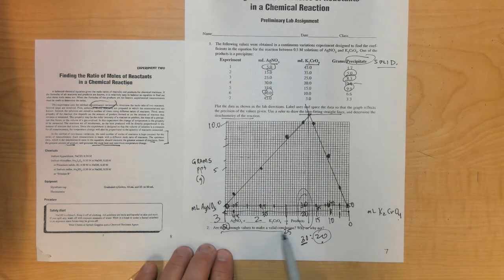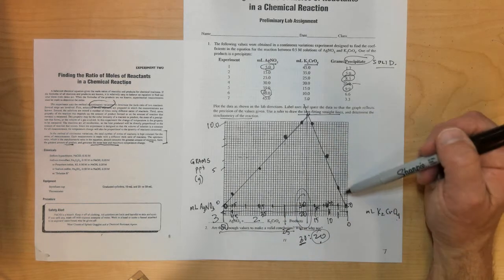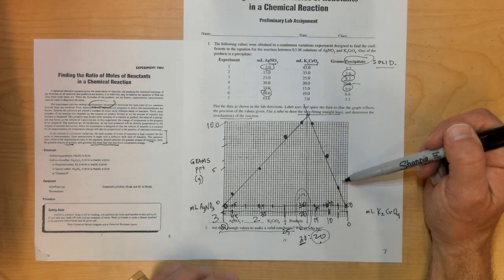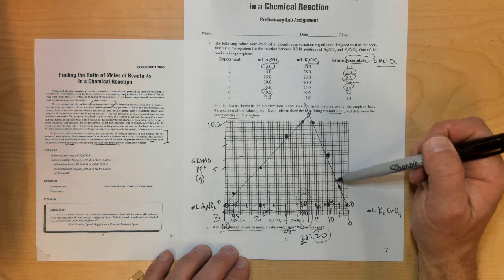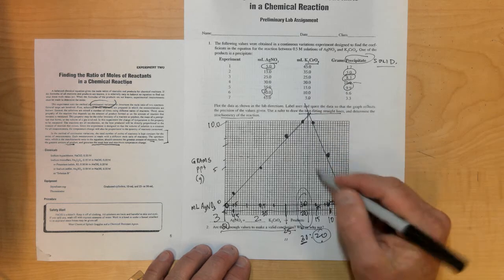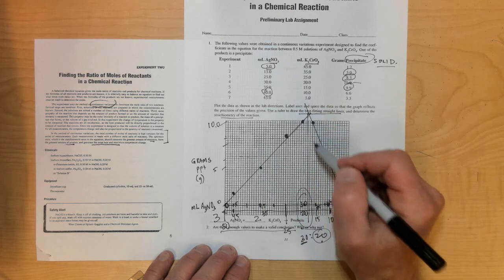Are there enough values to make a valid conclusion? Why or why not? Well, you have to have at least 2 dots to make a line, right? 2 points to make a line. And you always kind of want to have one in the middle at least. And it looks like we have at least one in the middle here. It'd probably be nice to have another dot or 2 up in this range, just so I can get the peak a little bit better.